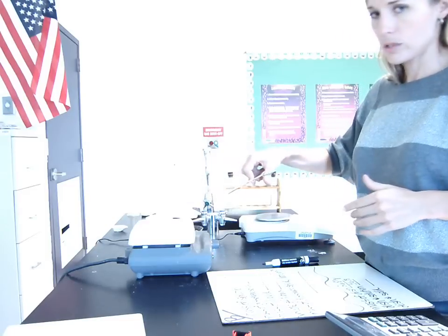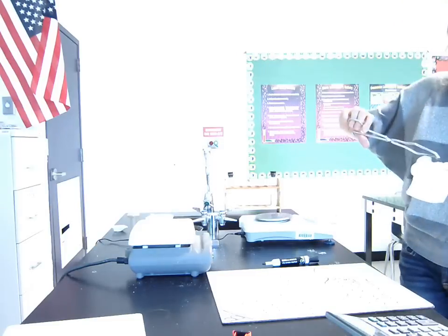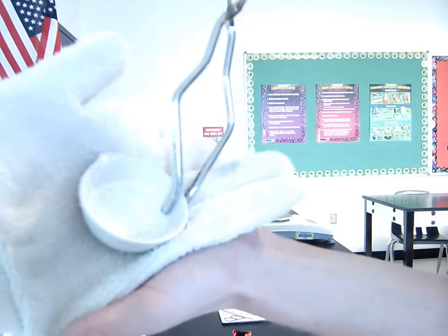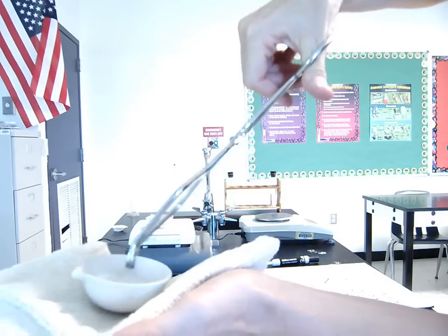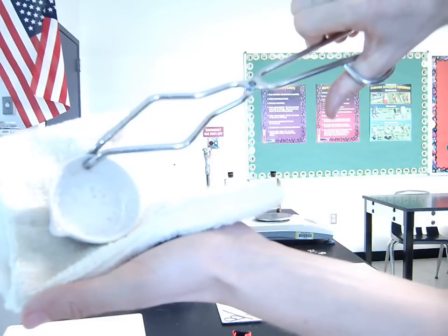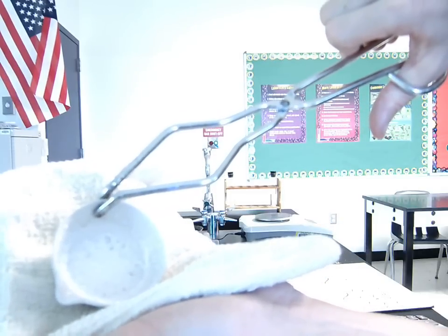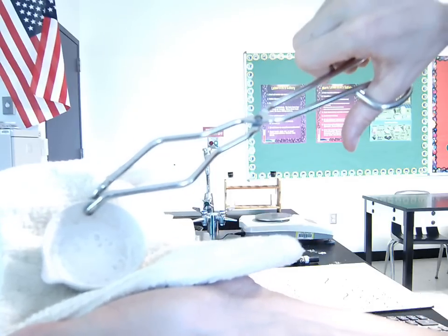Alright, so this is the part that might be hard to see. I really want you guys to be able to see what this looks like when we're done. I have no idea if this is going to allow us to see or not. Let's see. What you should be able to see, and I don't know if it's coming across that well in the video, is that there's like a white powdery, crystal-like substance almost in the bottom of the dish. It's hard to see on the video. In person, it's a lot easier to see. What you should notice, though, is that there's definitely something in the bottom of that evaporating dish.